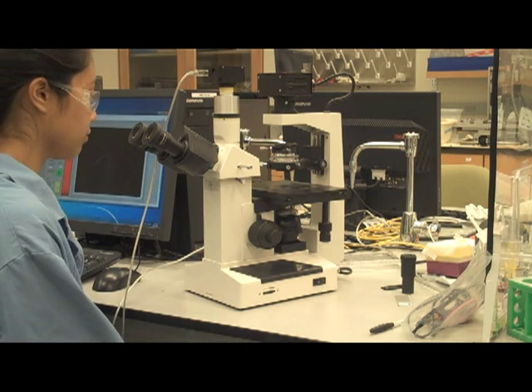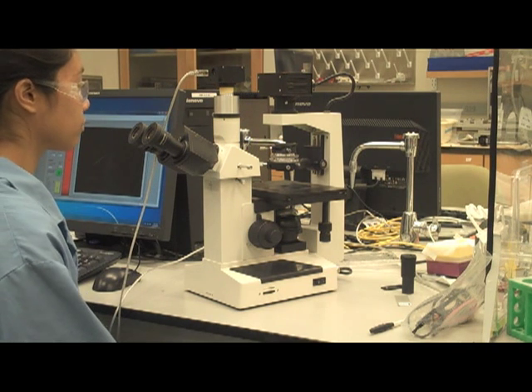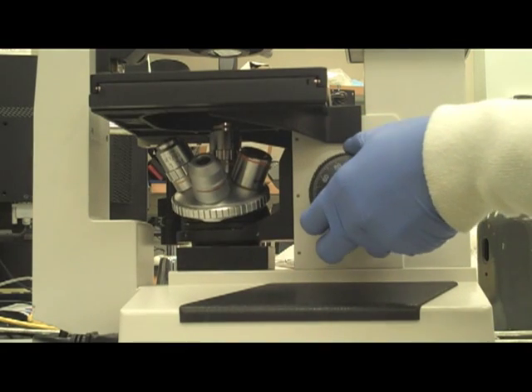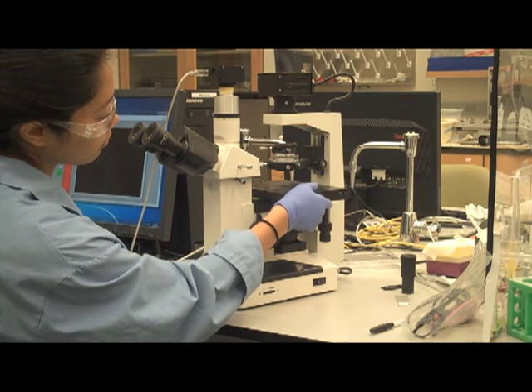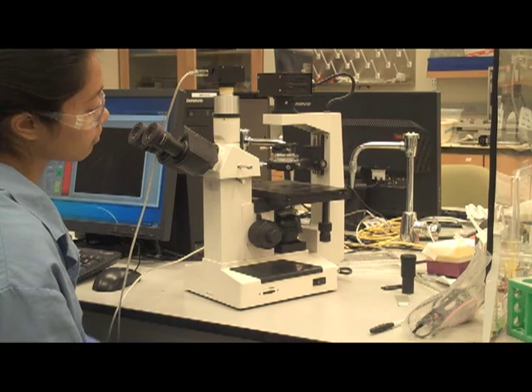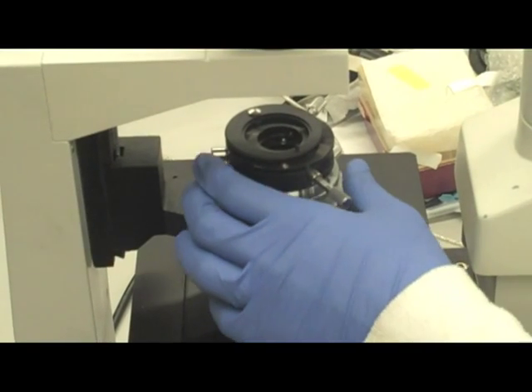Step 3: Slowly turn the coarse focusing knob until the working objective has moved all the way to the top, just underneath the stage of the microscope. Position the stage so that the objective lens is aligned with the opening on the stage.